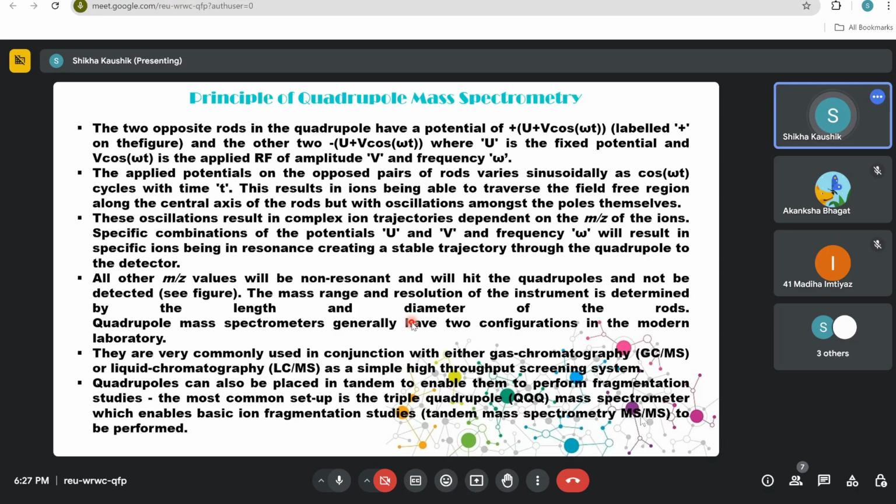That's why it is called high throughput, or an advancement of mass spectroscopy, because we can combine them with different types of sorters. With the help of chromatography you are actually sorting your proteins, you are selecting your pool, right? So you can combine these techniques so that you will have more resolved spectra, and whatever you want to study you can study that.